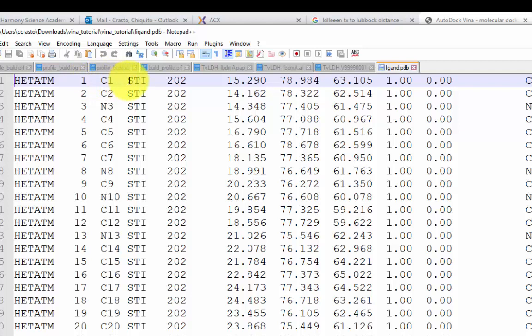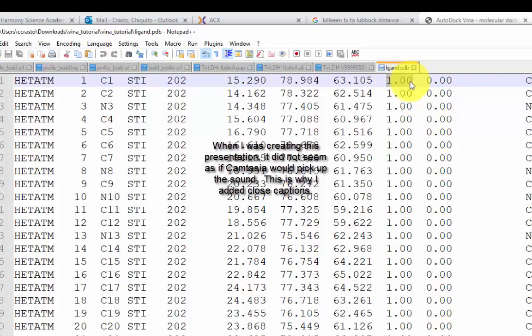And this is the ligand now. Okay, so we'll worry about what the ligand is later. That's the name. That is typically where you would find the name of the amino acid residue. Here's the position number, X, Y, Z. This is the atom type. This is the thermal factors. In this case, we're not really concerned about thermal factors, so that is set as 0. And then this is the multiplicity. This is where how many atoms occupy one particular position.